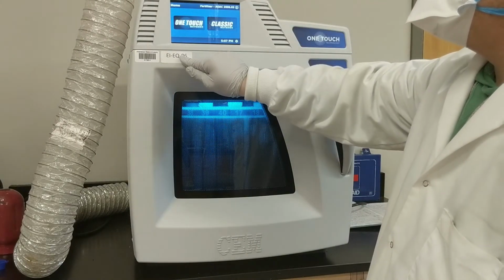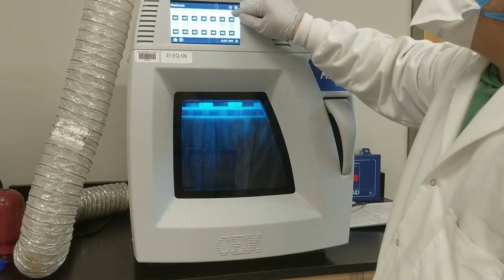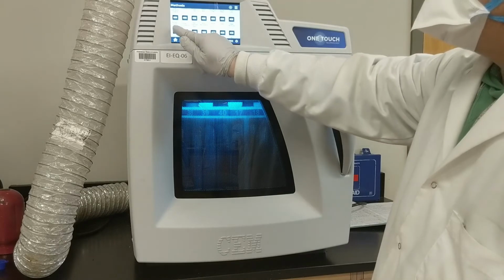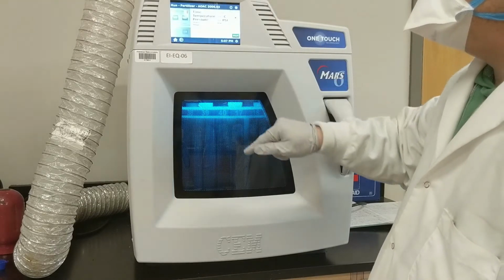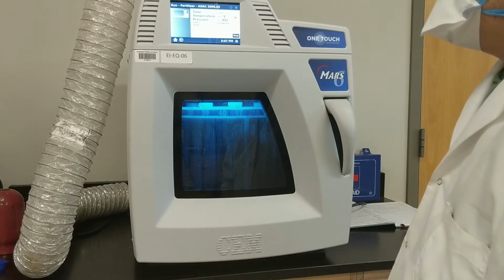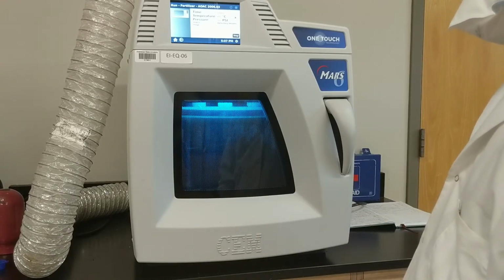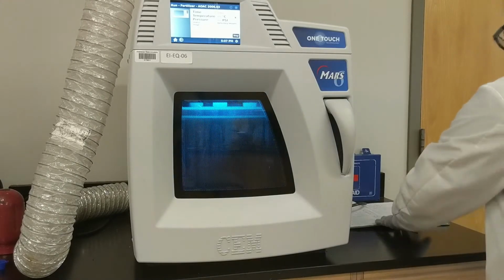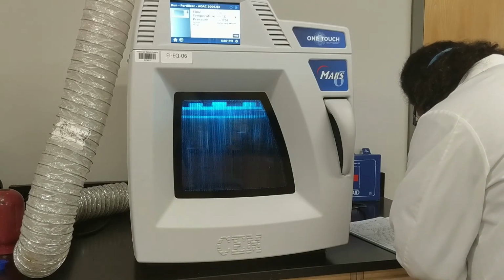So typically, all you'd have to do is touch start, but if you ever get out of the method that we normally use, you can go to one-touch methods, choose the AOAC fertilizer method, and then hit start. It should detect the vessels that are in there and eventually start the microwave digest. Make sure to record in the microwave logbook what you're digesting so that we have a record of the digest.